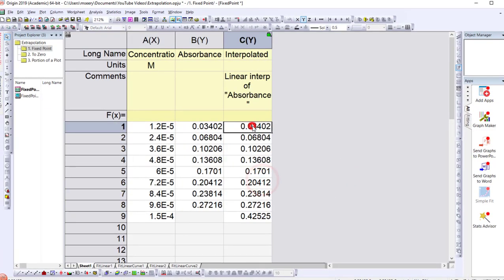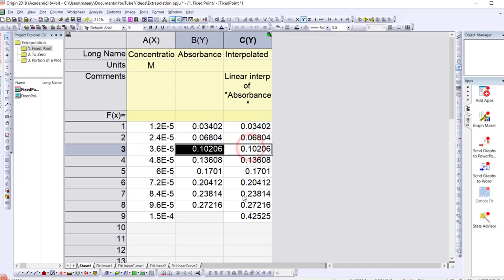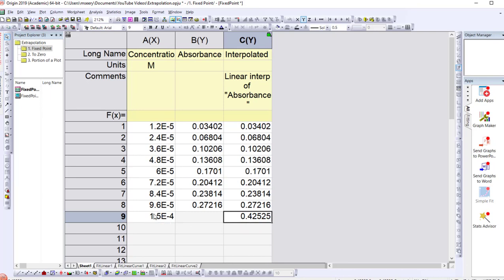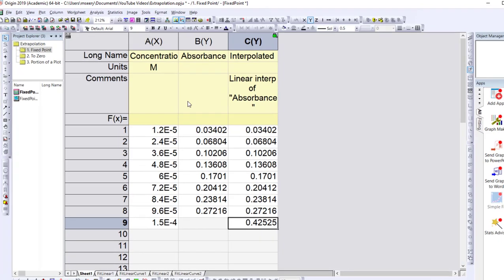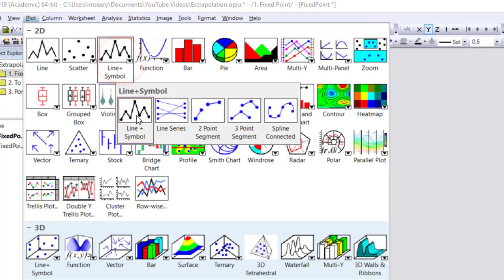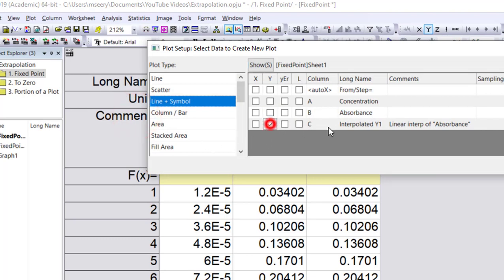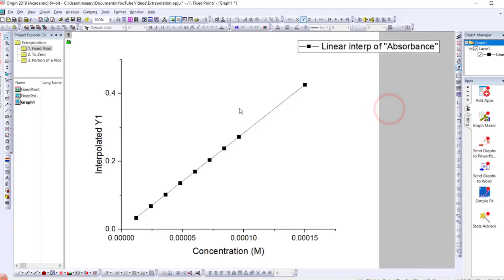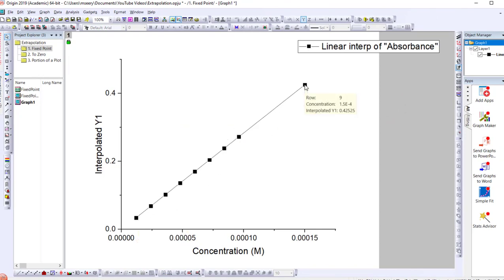The extrapolate option is selected, and Results set to 'New' so it adds the corresponding data into a new column. Clicking OK repeats the known values but now adds the new predicted absorbance value at our specified concentration. We can quickly draw a line-and-symbol plot with the interpolated y values against concentration to verify. The original data points appear alongside the new extrapolated point, and it's worth doing this to check the result makes sense.